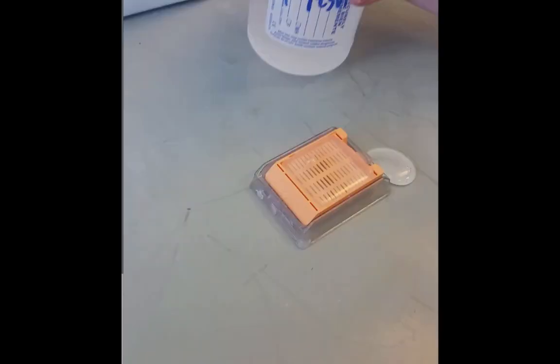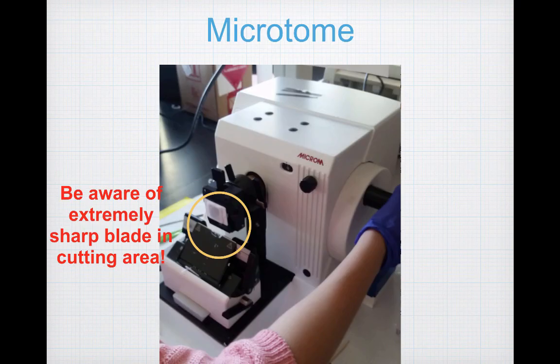After you've finished pouring your paraffin, you can let it cool on the countertop for about 30 minutes. Then properly label your specimen with your group name and date, and place it in the refrigerator until the next step. Once your block is finished, you're ready to start sectioning.